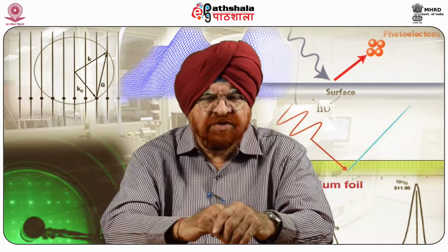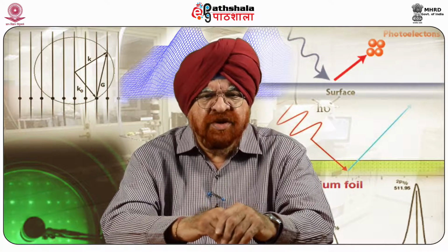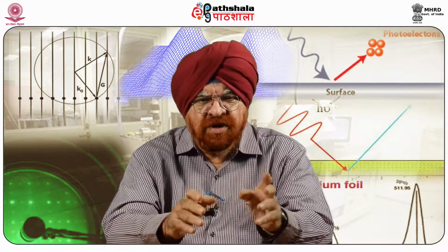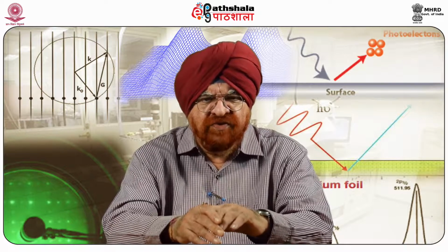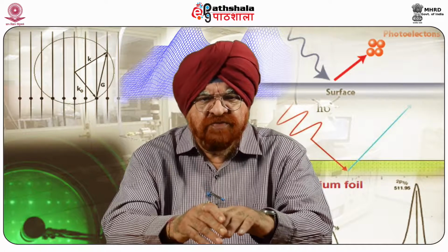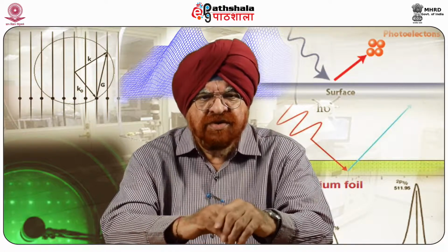MFM images of various substances can be seen in books and journals which have been published regularly. Examples are thin films, nanoparticles, nanowires, permalloy discs, and recording media.